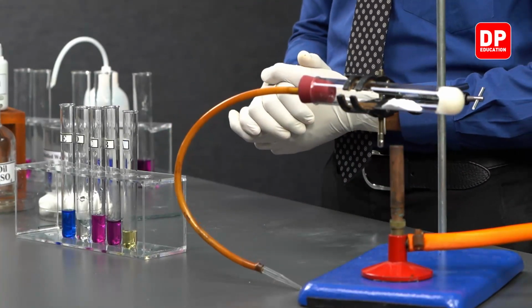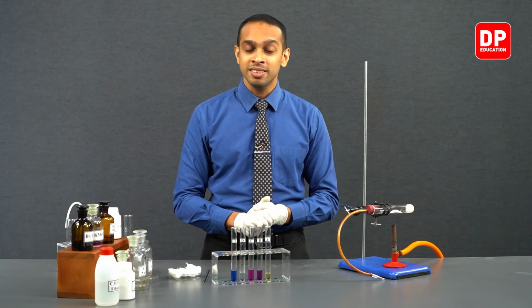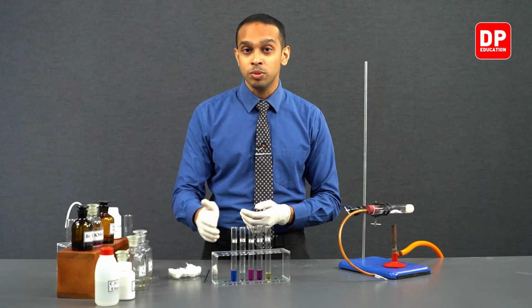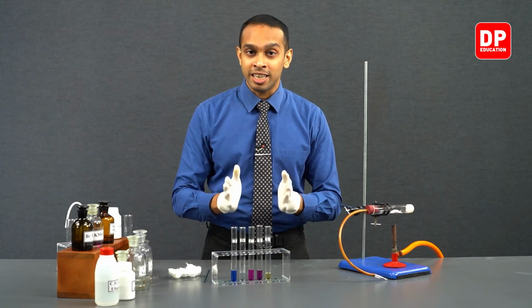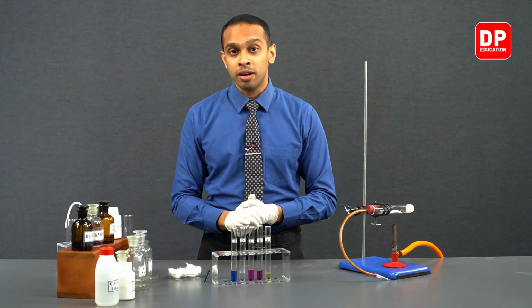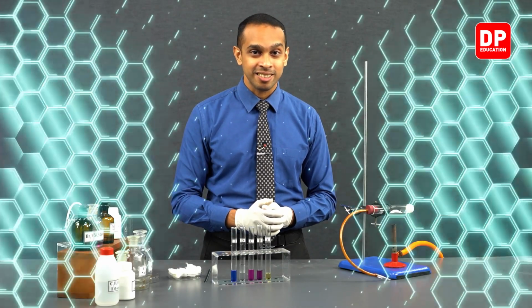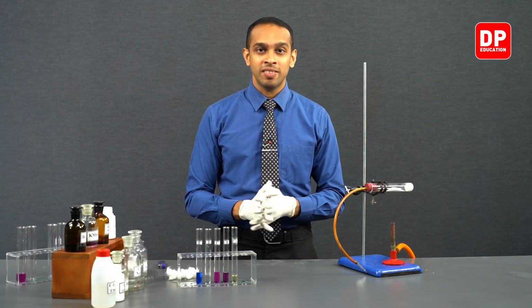So students, since we know what is happening here, let's move on to actually conducting this experiment. As I introduce ethene gas into each of these test tubes, you have to observe the color change that takes place. So let's turn on the Bunsen flame or Bunsen burner here, and then conduct our experiment and produce ethene gas. Now, let's light our Bunsen burner and start our reaction.